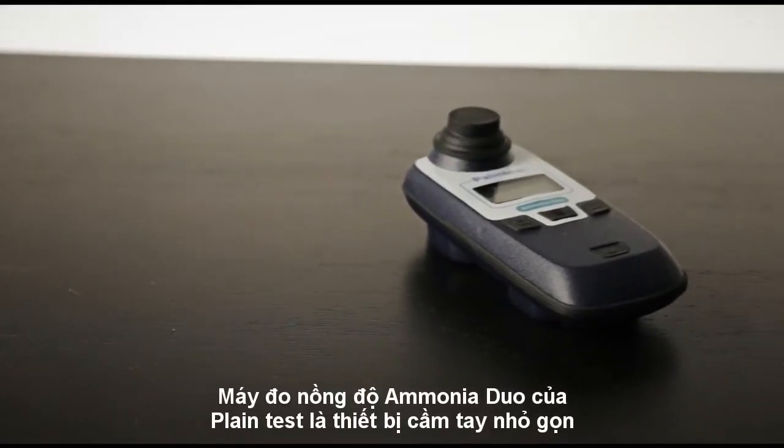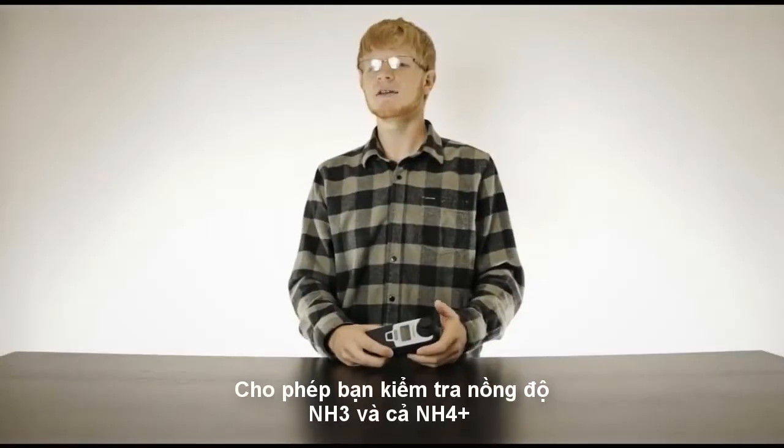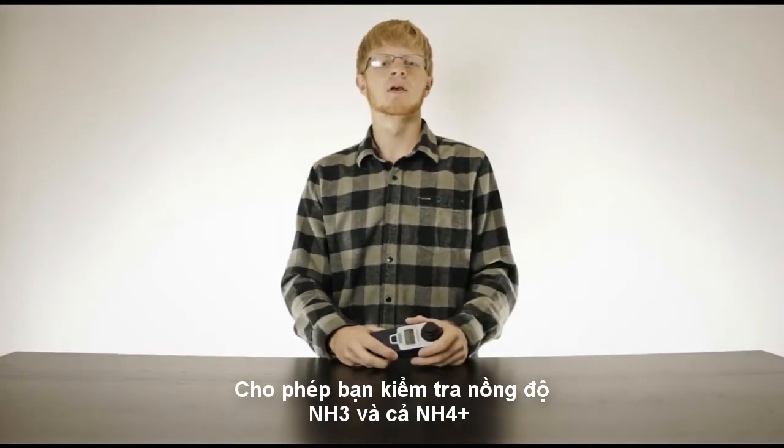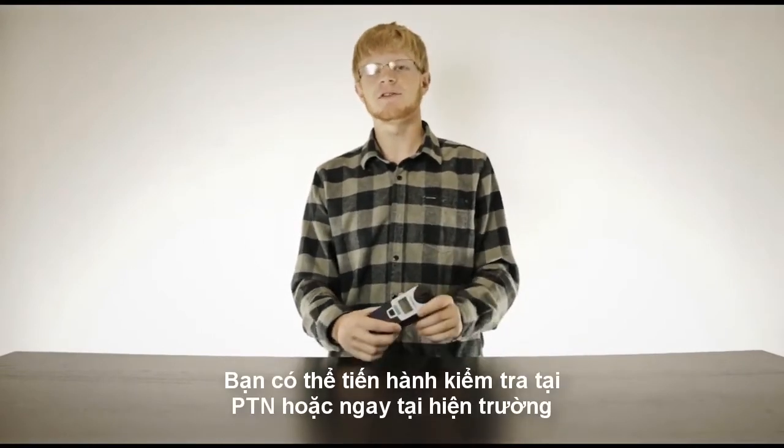The Ammonia Duo is Palantest's answer to the call for a compact instrument that measures ammonia and ammonium in any water. Whether you find yourself in drinking water, waste water, or dealing with environmental samples, this little instrument handles it all.